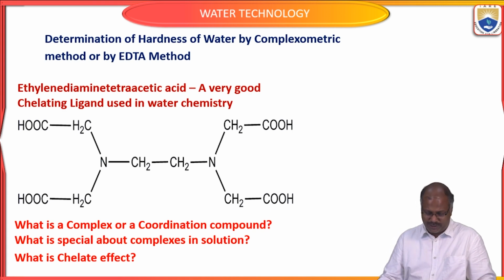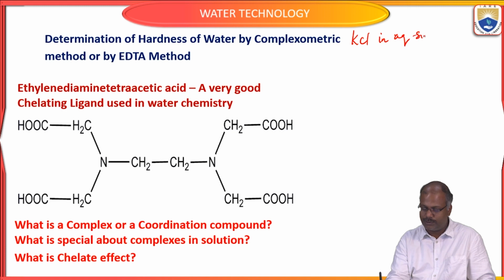What is special about these complexes in solution? For example, a KCl salt in aqueous solution will be K+ and Cl-.